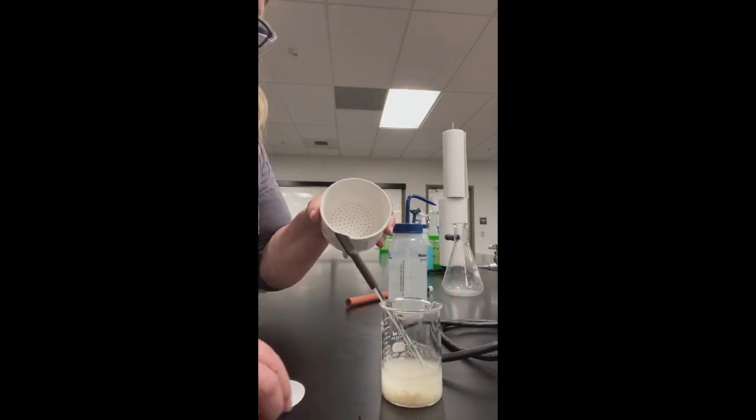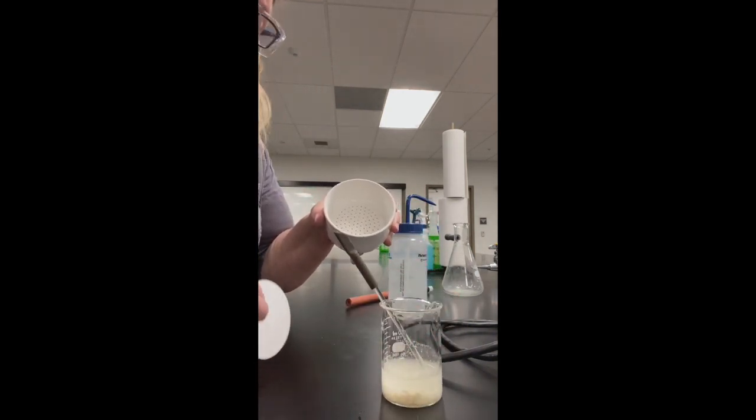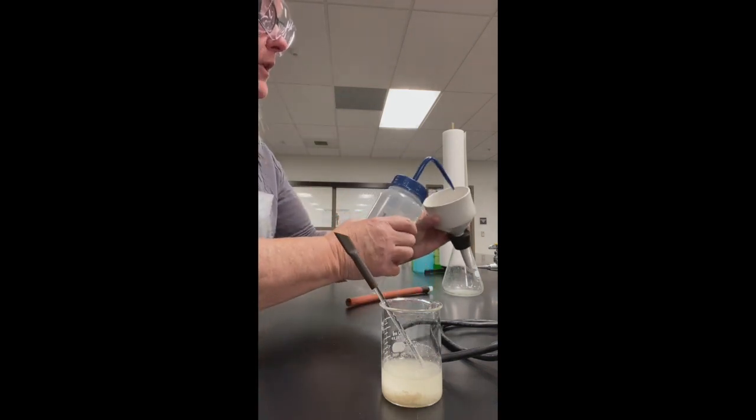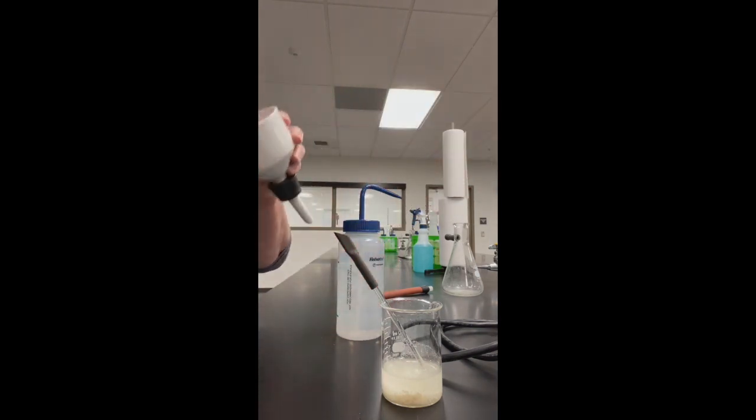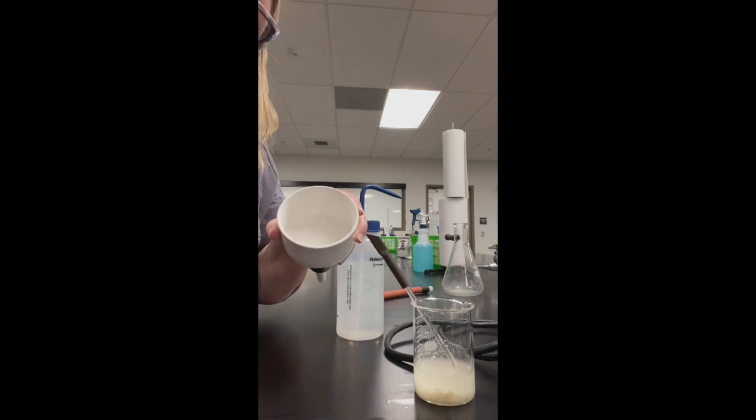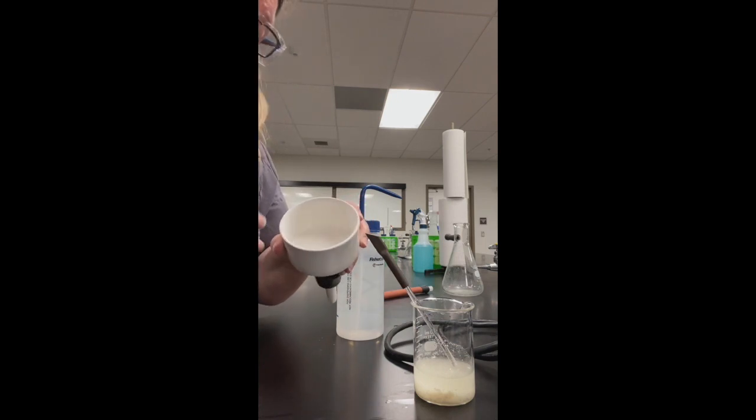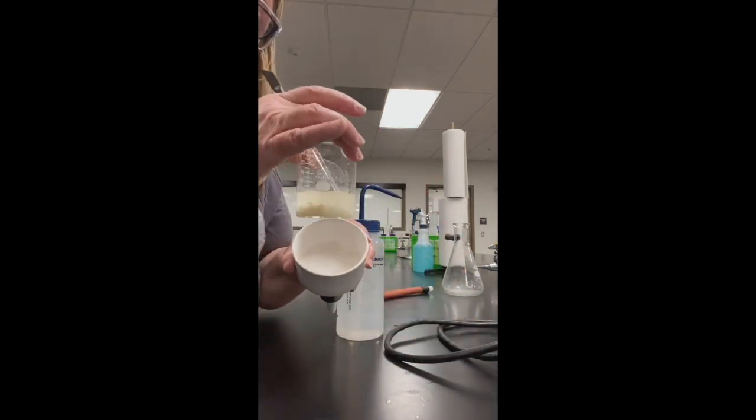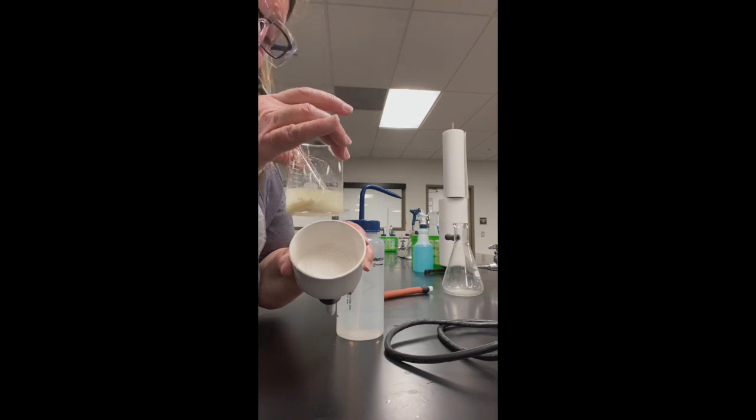Next I'm going to use my Buechner funnel to filter the crude crystals. Keep in mind when you use a Buechner funnel, you lay the paper on flat. You put a little water in there so it stays nice and flat. And then because we're doing this filtration with cold methanol and cold water, I'm going to pre-treat this with a little bit of cold water first. That way I don't accidentally, with it being too warm, make these crystals go out of solution.